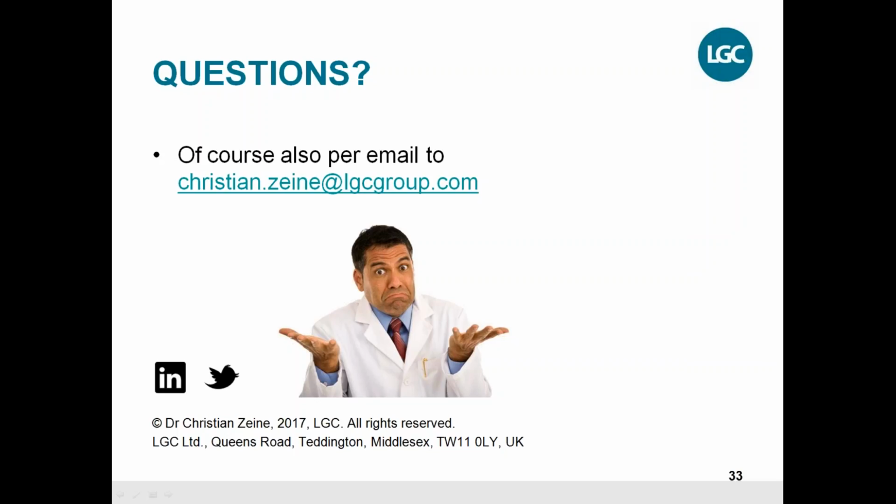It takes some time and some effort to give uncertainty values in the certificate, so we don't do that at this point for impurity reference standards. However, for our primary reference standards, for the active pharmaceutical ingredients, for example, you see those values given. We have uncertainty values there because these materials are produced under ISO 34, and for that we give uncertainty values.